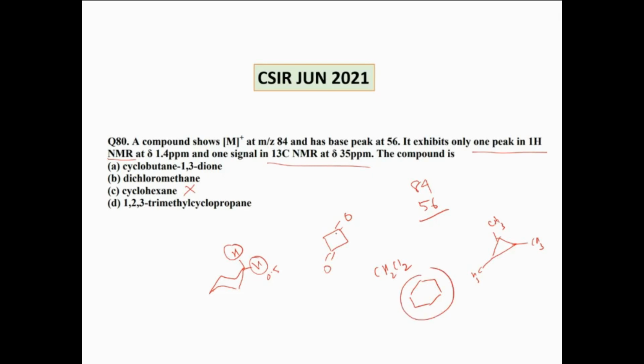இப்ப இது எத்தனை கார்பன் பீக் கொடுக்கும், இந்த சைக்ளோபியூட்டன் எத்தனை கார்பன் பீக் கொடுக்கும்? Guys tell me. 2 ma'am. 2. இது ஒரு கார்பன் பீக், இது 2. சோ இது தப்பான ஆப்ஷன், ஏன்னா ஒரு கார்பன் தான் சொல்லிருக்காங்க. இது எத்தனை கார்பன் பீக் கொடுக்கும்?